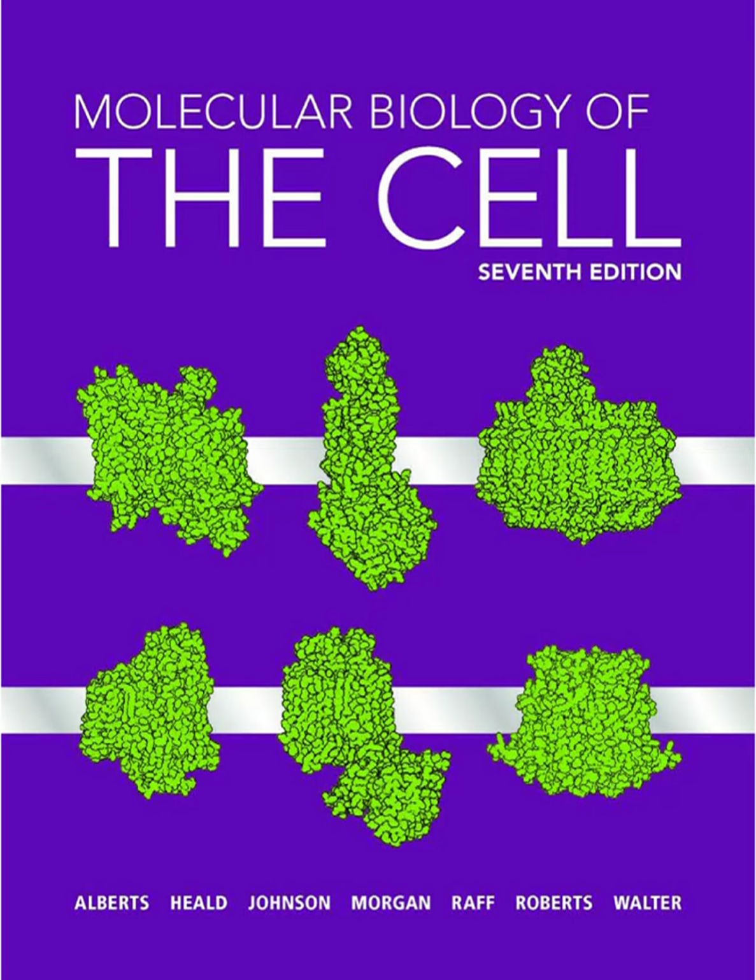What's the difference? Resolution is telling two things apart. Detection is just seeing one thing. So you can actually detect a single fluorescent molecule or a very thin structure like a microtubule, even if it's much smaller than 200 nanometers. You just can't see its true tiny width. It still looks like a blurred spot. Exactly. You see a blurred spot of light, but you know something's there. You just can't resolve its actual shape or separate it from another one right next to it.